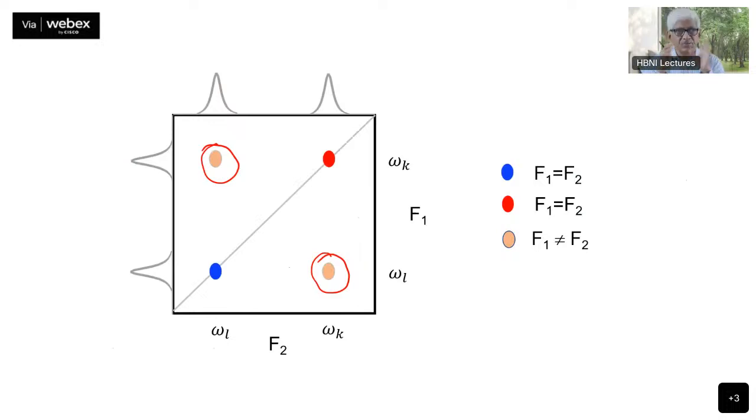And schematically, one can show it like this. There is a much more complex situation that we will analyze in greater detail. So this is called correlated spectroscopy in general, but the correlations can arise as a result of different kinds of mixing. The mixing is the crucial period which determines what sort of magnetization transfer will happen, and that determines the nature of the spectrum.